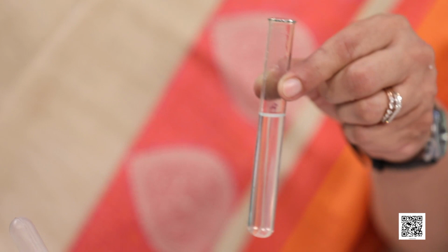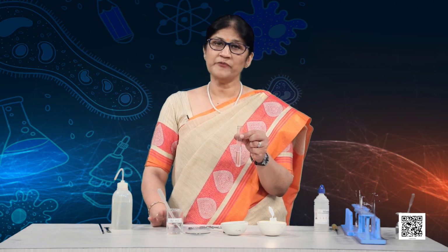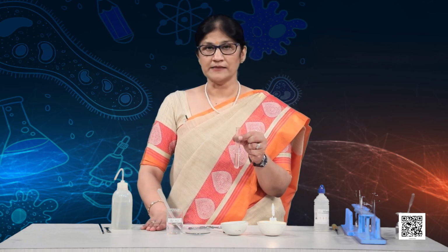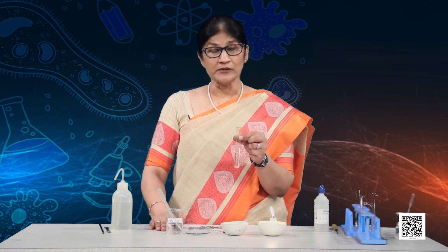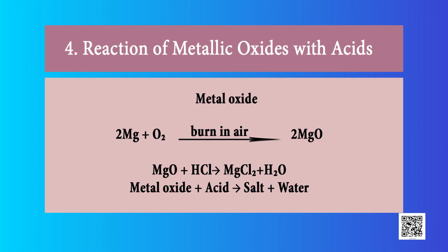Okay. So, the pink color that we had between phenolphthalein and metallic oxide has disappeared when we added some acid. So, the reaction is similar to what we did between bases and acids. Here also a metallic oxide, because it is basic in nature, will give us a salt and water when it reacts with acid.